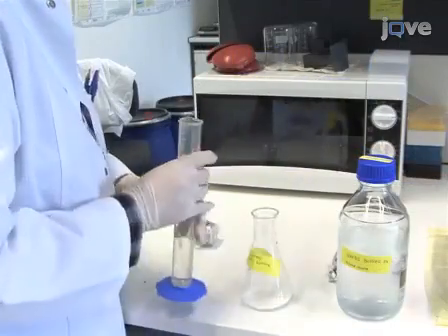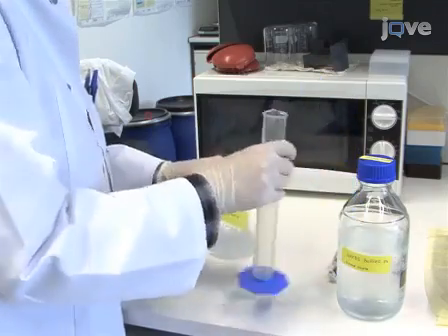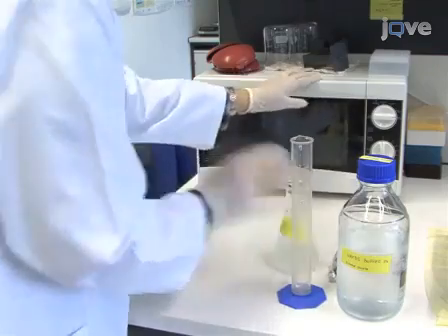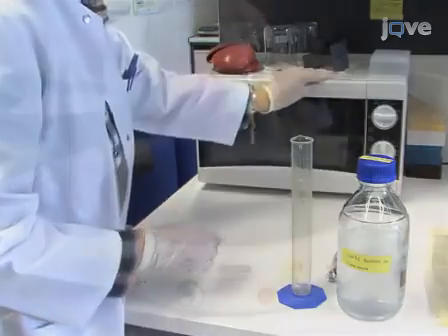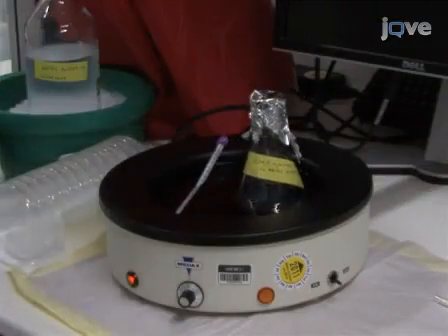About two hours before dissection, prepare 100 milliliters of 4% low melting agarose in Krebs buffer by microwaving the solution until the agarose is completely dissolved. Then place the agarose in a 45 degree Celsius water bath.